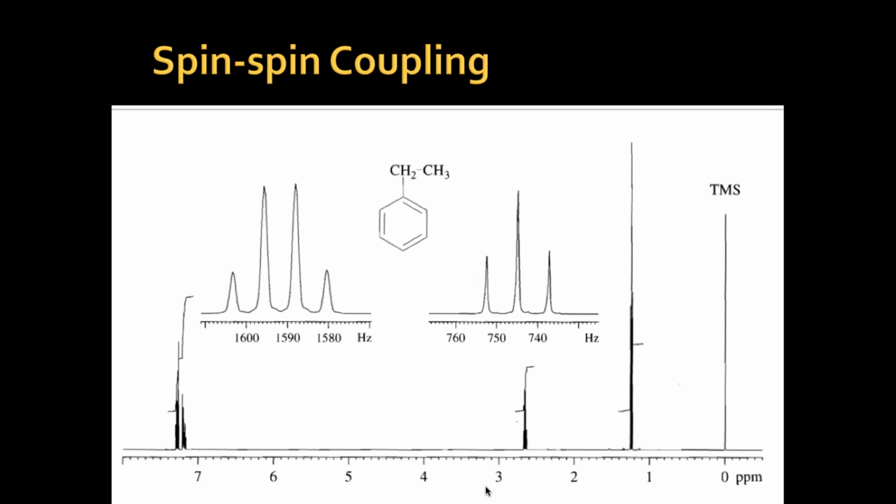A hydrogen present on carbon and a hydrogen present on oxygen are two very different things. OH and CH.